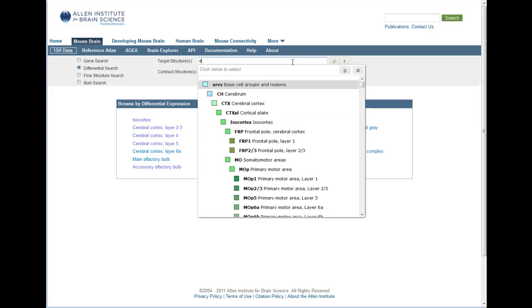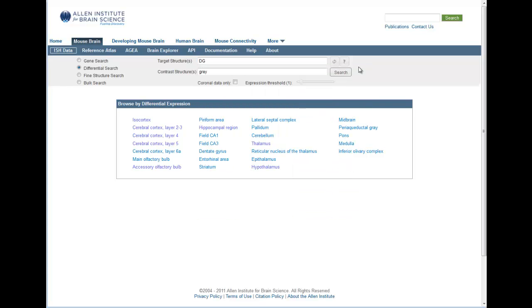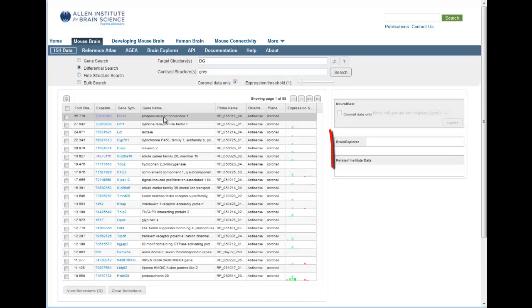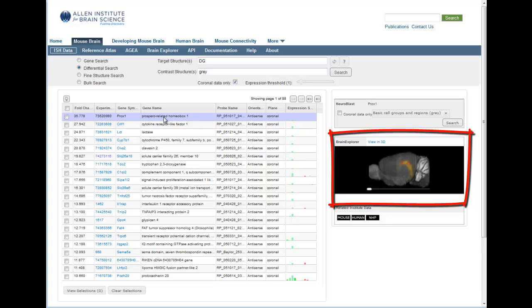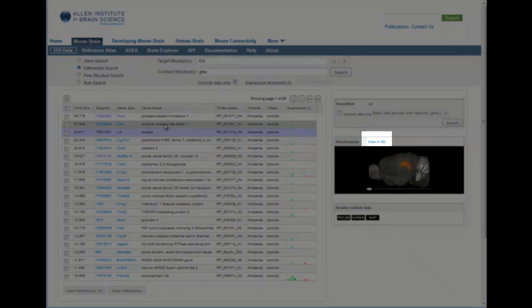We're going to start building a mouse brain from the hippocampus out. In the target structure box I've typed dentate gyrus, which will pull up genes that show high expression in this region when contrasted with the rest of the brain. For this demonstration I will be choosing only genes that were assayed in the coronal plane. I can view in thumbnail form the pattern of gene expression by clicking on the gene name, and I can view a gene in Brain Explorer by clicking on this link.